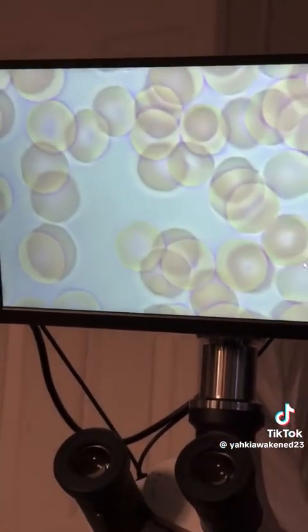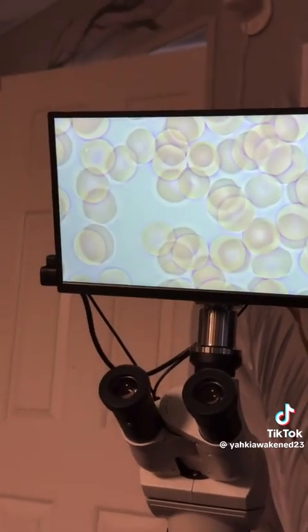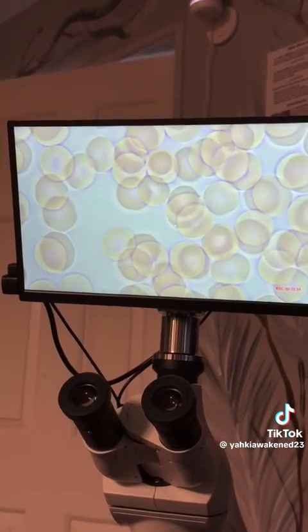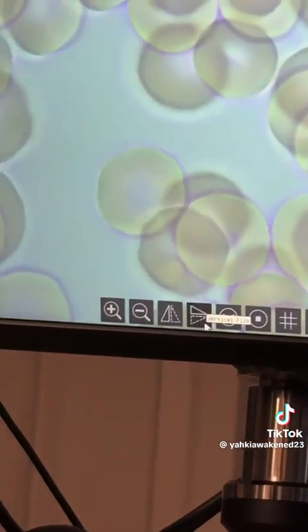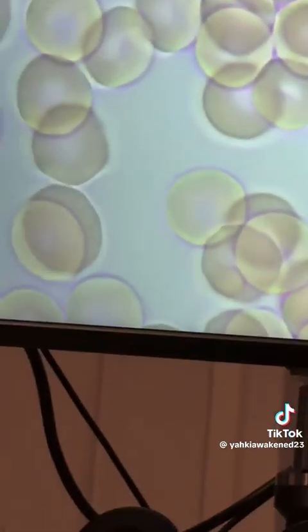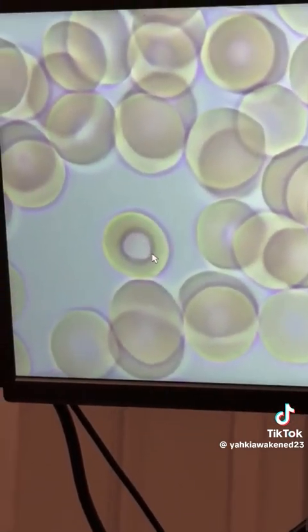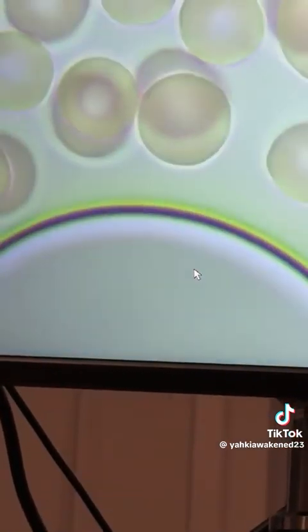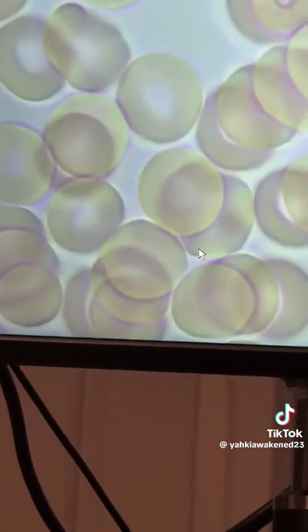We see a bunch of target cells. Target cells are hollowed out red blood cells. Then you can see these little flickerings. These are parasites within inside of the system. So this is what you would call a blood parasite infection. If it's in the bloodstream, then it's deep within the cellular tissues anyway. Here go another target cell. And look, if you can look inside the target cell, you can see parasites in there. Look at that one right there. Let's see if we can find some big boys.